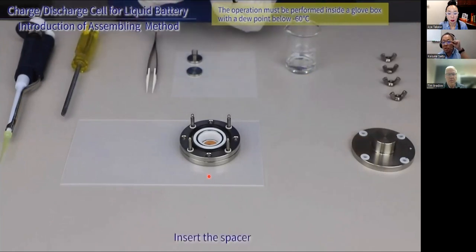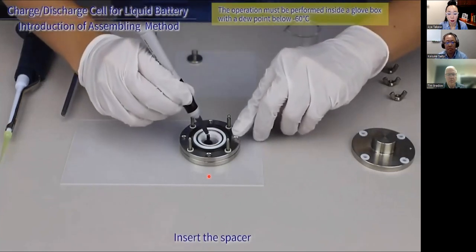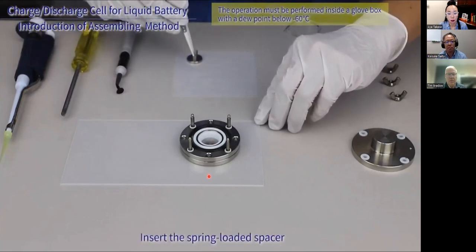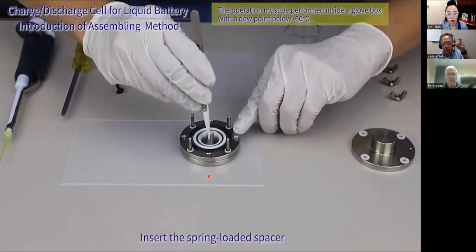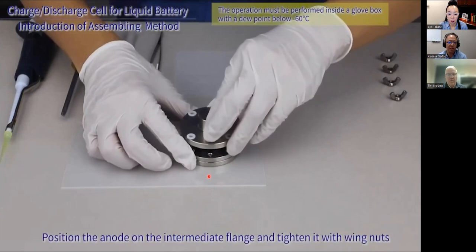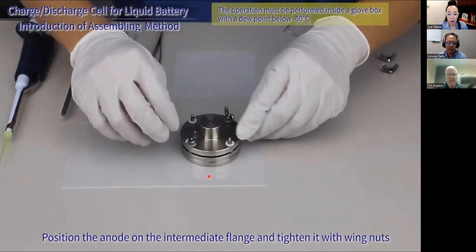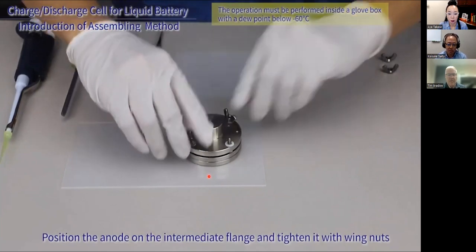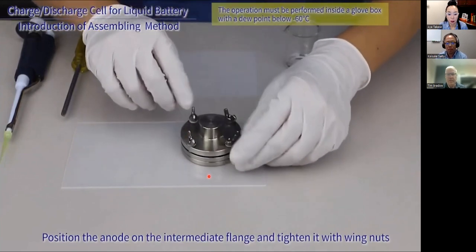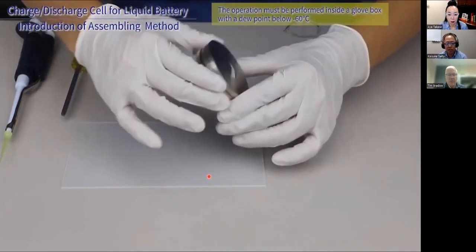Then depending on your thickness, if your thickness is really thick, you may not need this kind of spacer. But if you have a typical thickness of the materials, you need to have the spacer. Finally, we put another spacer with the spring on it. This spring pressurizes very softly, gently to your structure. Then we put the lid, and finally we screw the lid to the sample holder. That's it. Now we have completed the preparation.